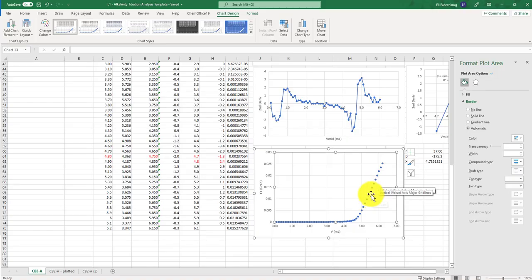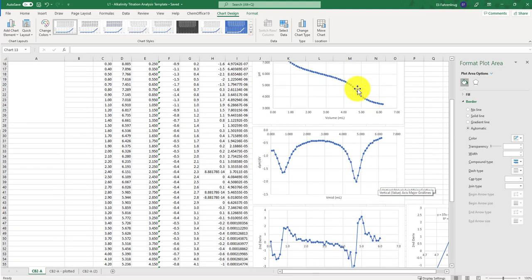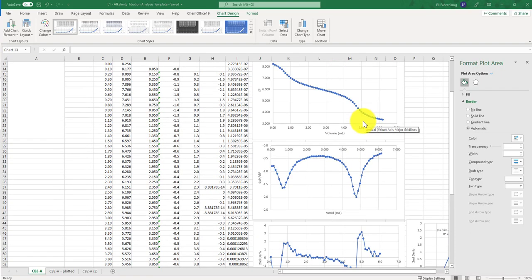And it turns out this is often, not always, but often, the most precise way to compute it, simply because it doesn't rely on the equilibration challenges of the pH electrode when you have wild swings in pH near the equivalence volume. Because remember, when you're doing this titration, you're adding tiny drops, maybe half drops of your titrant, and you're seeing half to maybe even full pH unit changes in your data. That's an order of magnitude change in proton or hydroxide concentration in the solution that your pH electrode needs to respond to. And it can't do that very quickly.